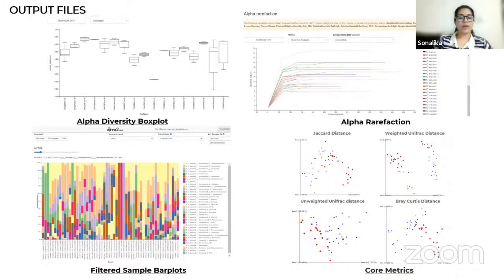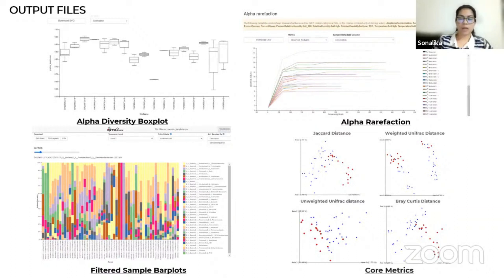It includes QIIME2 alpha rarefaction, which illustrates the number of samples in each group. QIIME2's remove-eukaryota step generates an interactive bar plot of taxa present in the samples. It also includes group significance plots covering alpha and beta group significance.